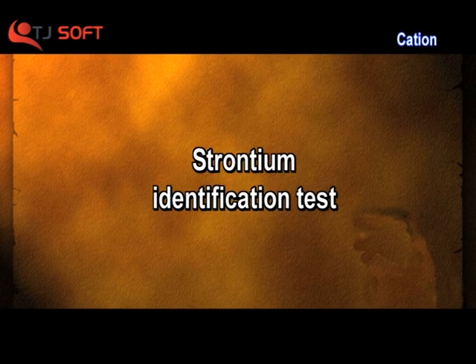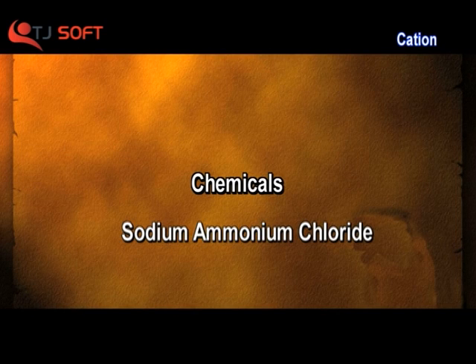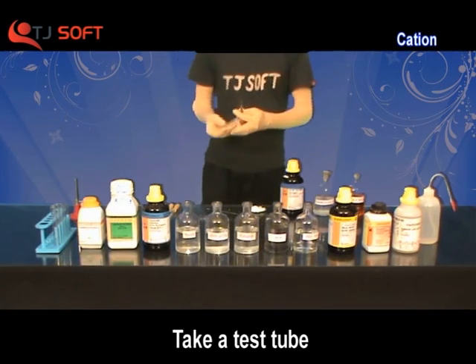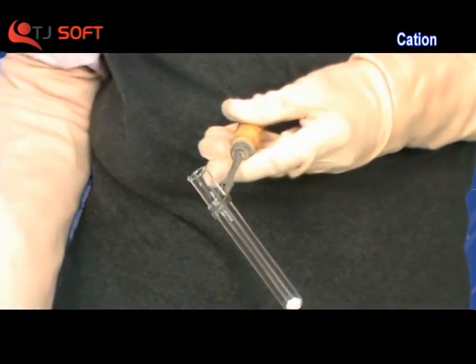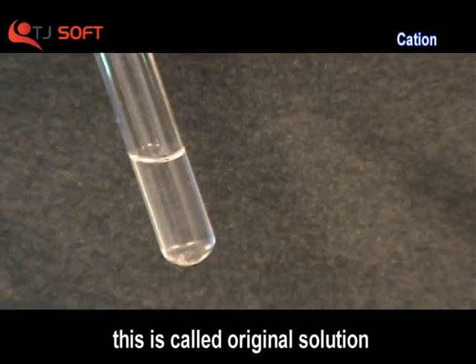Cation Strontium Identification Test. Apparatus: test tubes, pipette. Chemicals: sodium, ammonium chloride, ammonium hydroxide, ammonium carbonate, potassium bromide. Take a test tube. Add a little amount of salt with the help of a spatula and add cold distilled water. Now shake it well. This solution is called the original solution.